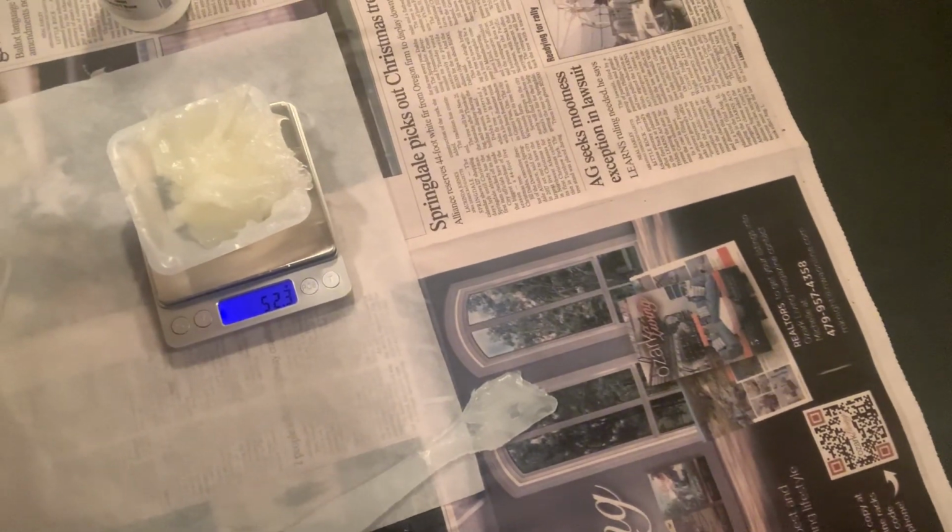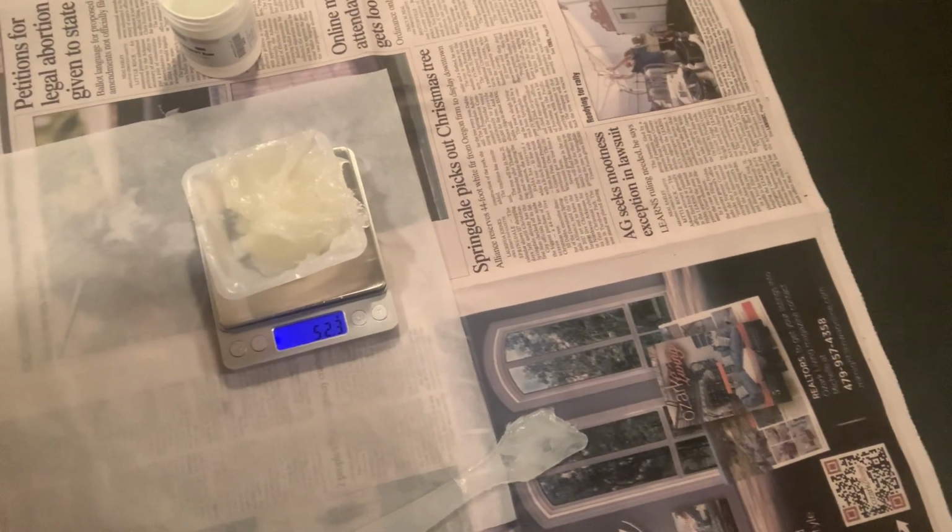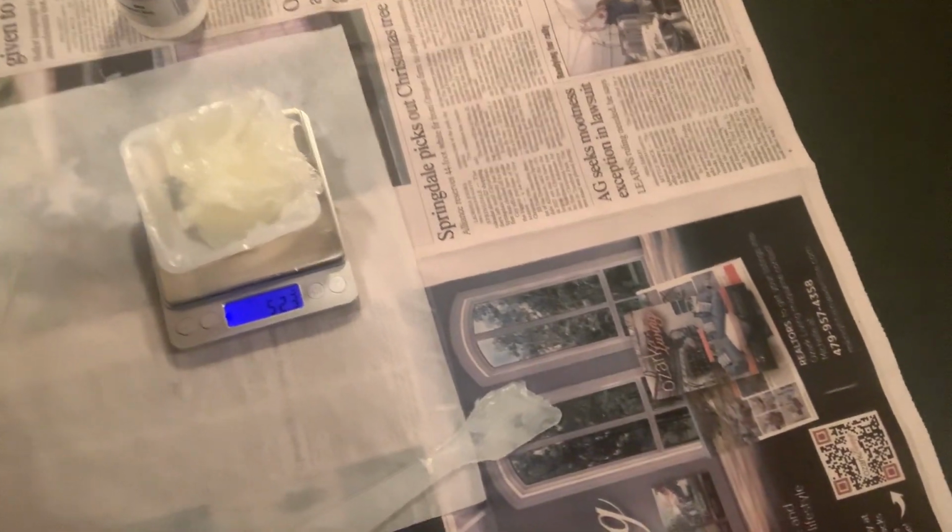Remember that it is the minimum and maximum weight allowed. So it doesn't have to be exact every single time. So that's what I have right there.